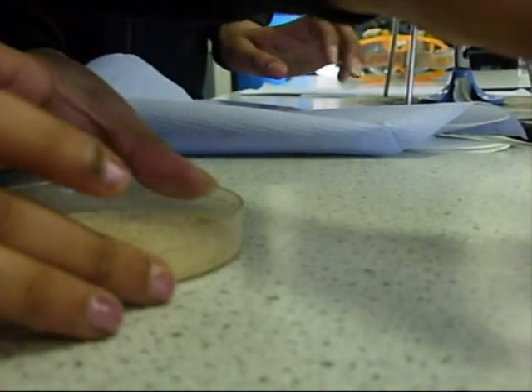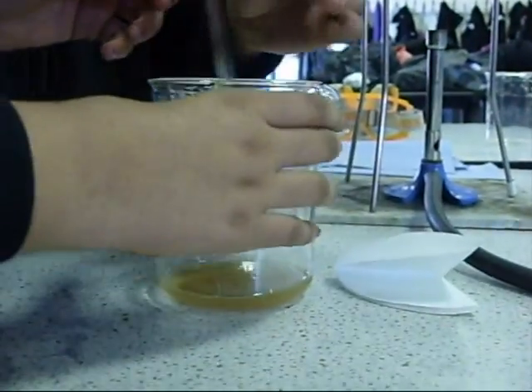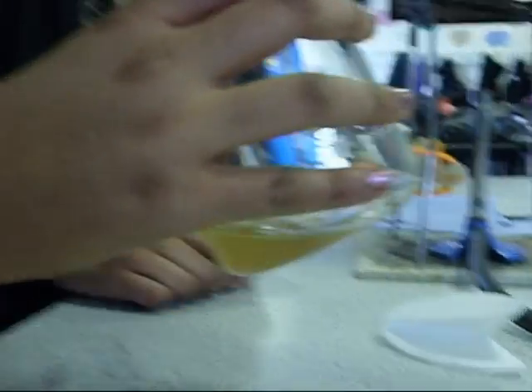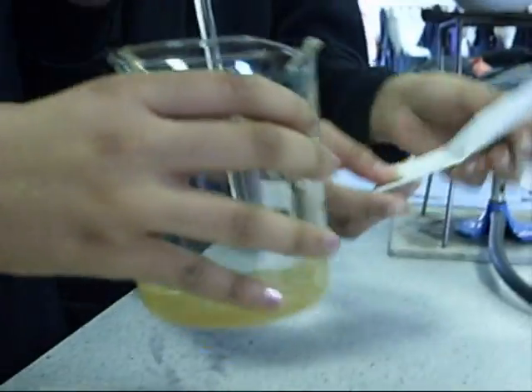Now we're going to put this to the side. You can see that all of this is a mixture of salt and sand. And we're going to use the stirring rod to dissolve all of the salt in the water.